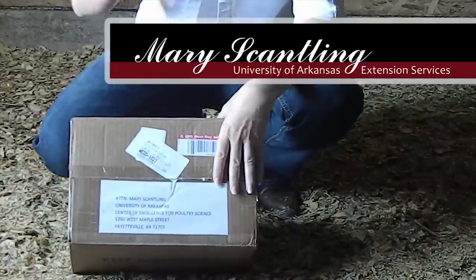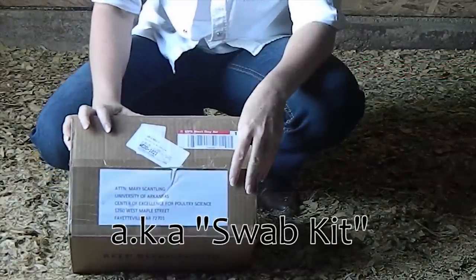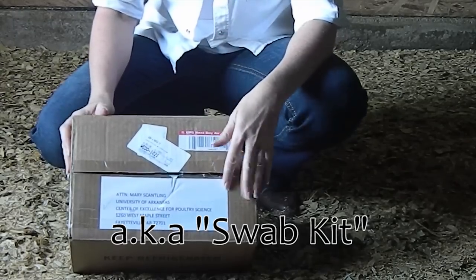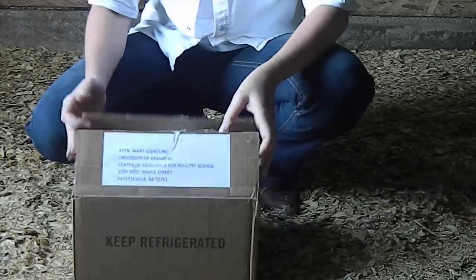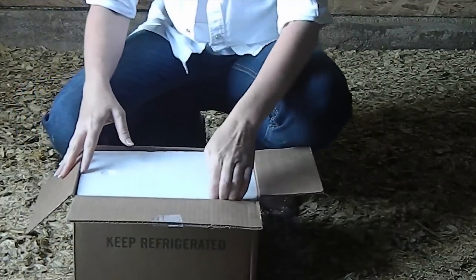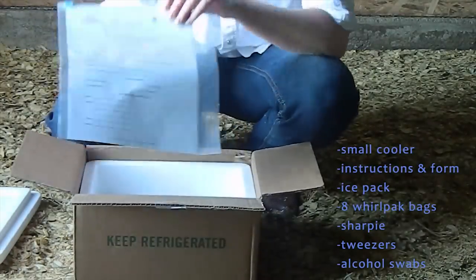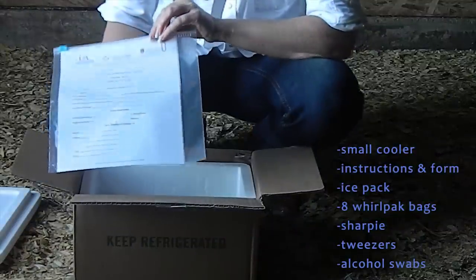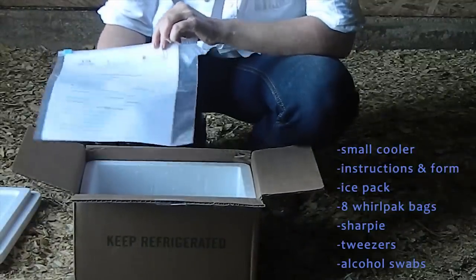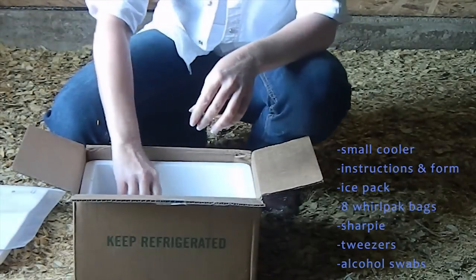This is University of Arkansas's instructional video for a bacteriological sampling kit that we'll send out to growers or anyone who requests it, so they can test the water lines in their poultry houses. What you'll get from us is a kit that contains a small cooler. It'll have instructional sheets telling you how to do drip sampling, bacterial sampling, shipping information, and sample submissions so that we know what you want tested.